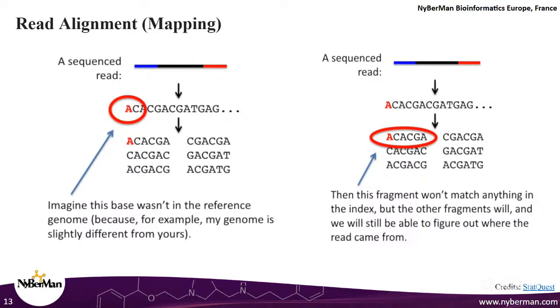So there is something called hg19, there is something called GRCh37, GRCh38, etc. Or you, as a researcher having an independent lab, might also have your own version of the reference genome. Say, for example, if you're doing an experiment using yeast or E. coli, your lab might have its own strain of E. coli which has its own reference genome, right? That is absolutely plausible. So mismatches like these are very common.